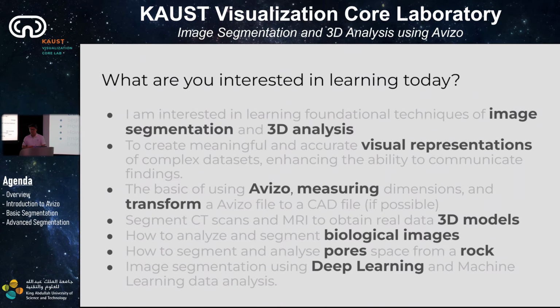and some people talked about membranes. So we're going to look at a membrane as well, in particular pores, right? This is a very common theme here in KAUST. People are interested in analyzing pores, so we will touch on that as well. And finally, deep learning. We will look at some deep learning tools that can help you with image segmentation.